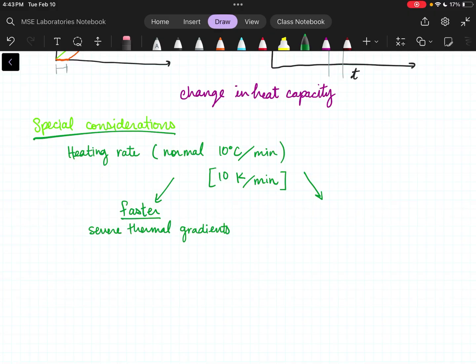We would have also exaggerated kinetics. That is where the ice cube is going to melt quite a bit faster in a furnace than it is at 1 degree Celsius. But that doesn't necessarily mean that that is usable or important data. So the kinetics, the time-related bit of information, is going to be really significant. And if your oven is preheating, which is what our furnace is doing, it's constantly increasing in temperature.